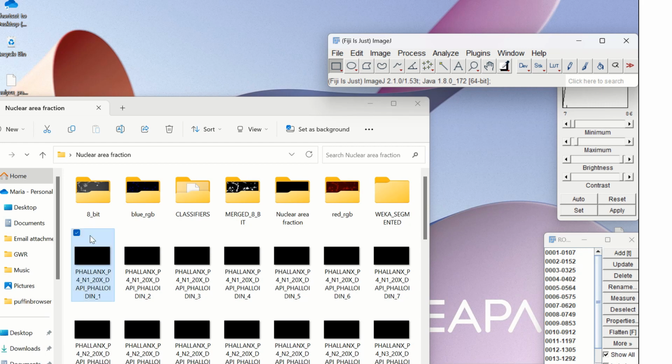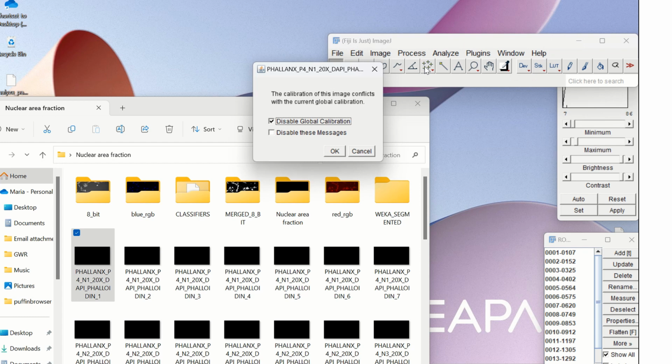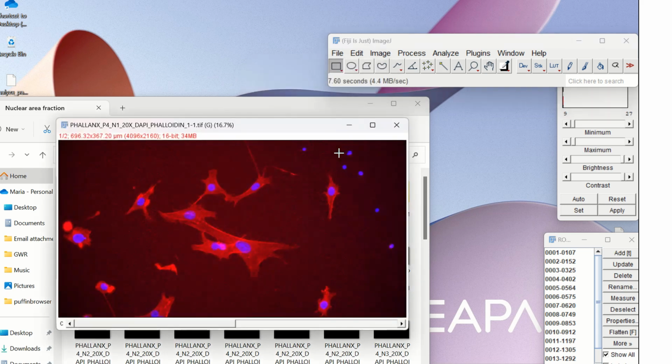Okay, I figured out a way to do the blue, and this is without Weka segmentation. It is a little bit faster, and I will record a macro for it so it can be automated. But I have to show you how to do it by hand first. So here you take your stack, which has your red and blue channels, your raw one. This is the one that we keep going back to.